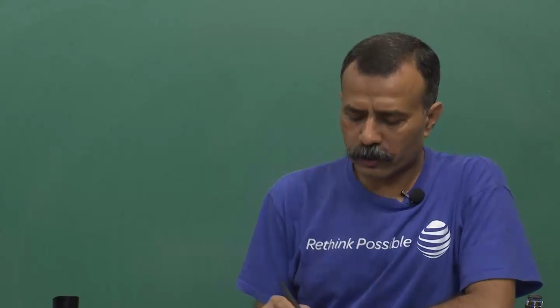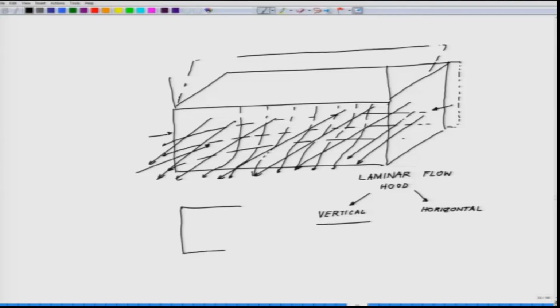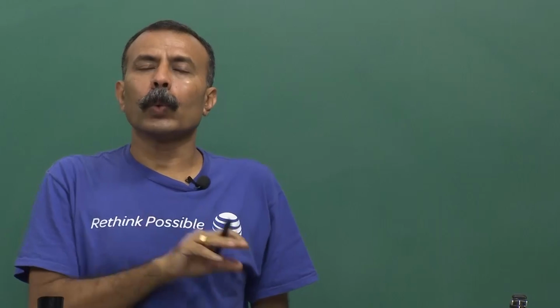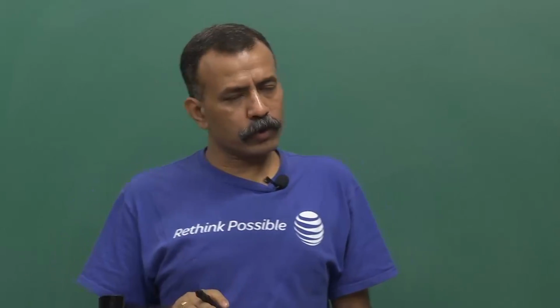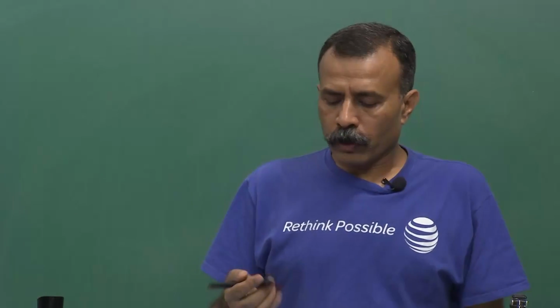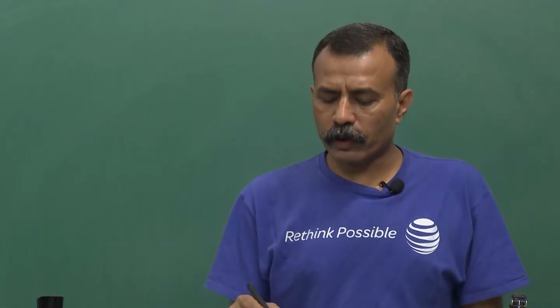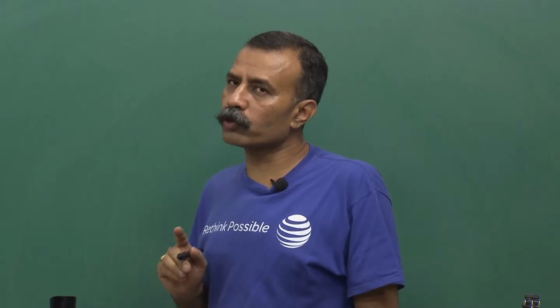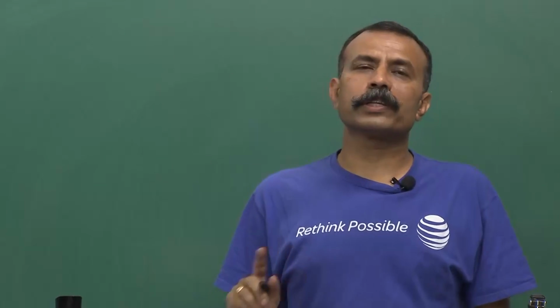It will be a cubical structure, something like this, a 2 to 2.5 feet cube, the smallest one, where one individual can work without disturbing anybody, but there is no option for a second person to sit in this. If you are clever, you could have 2 of them side by side, so that 2 people can work absolutely individually without disturbing each other.